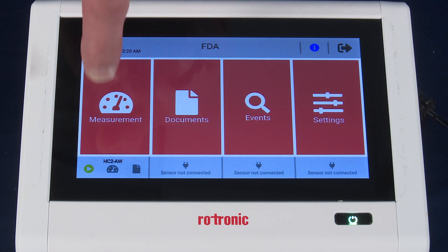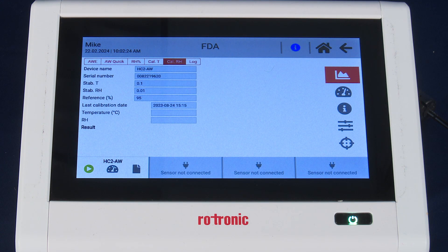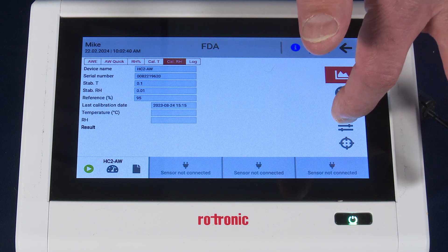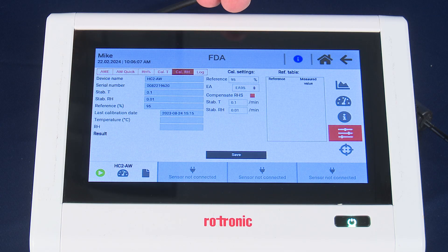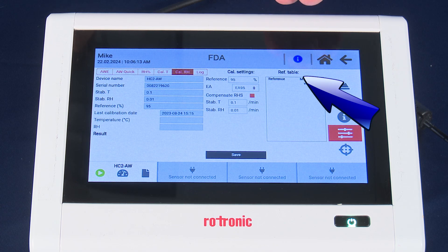Our next step is to press the icon with the dial again at the bottom left-hand corner of the screen. You'll now be brought to a new display, and you want to make sure the CAL-RH tab is highlighted. Then go to the right-hand side and press the three sliding bar icon, which will bring you to this display mode. You'll see CAL settings displayed as well as the reference table.